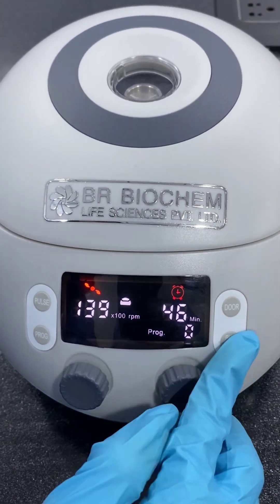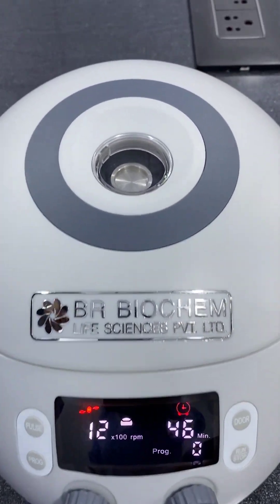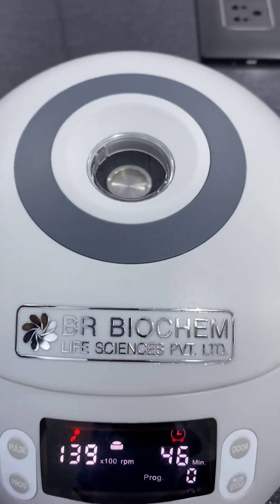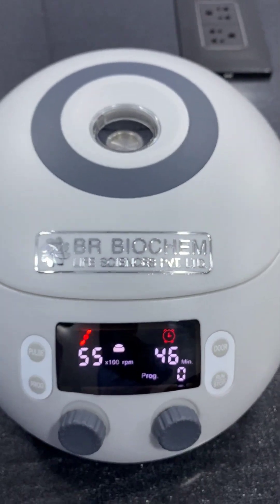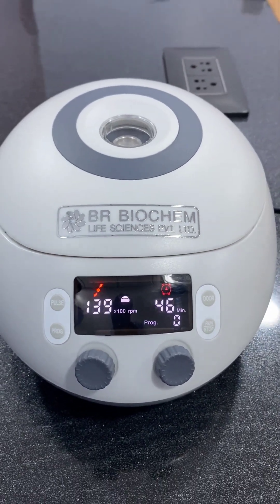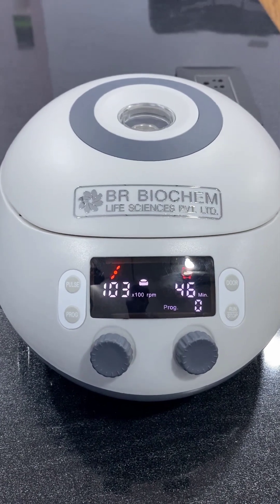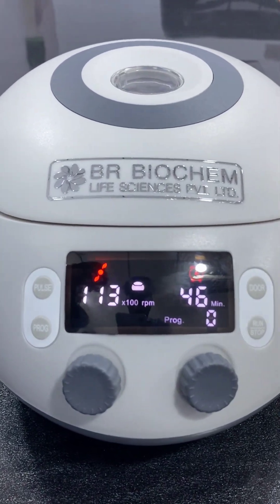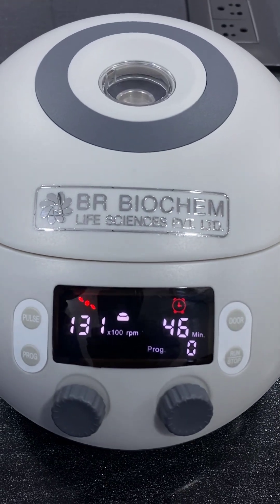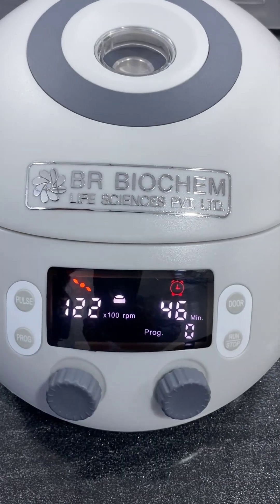After setting the time range and speed range, press the start button. If you want to stop the process in between, press this button again.